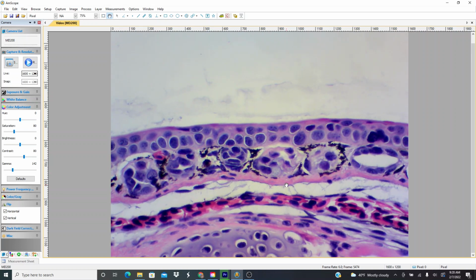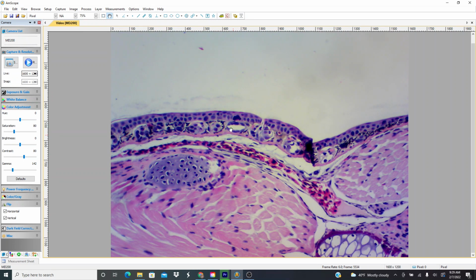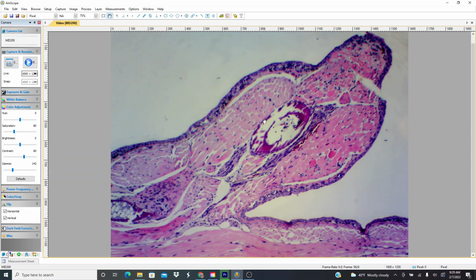Yeah, this is the skin. It doesn't really look like human skin. Made of a single layer, or 2 layers of cells actually. You can see there's a line of nuclei going this way, and then another one at the bottom called the basal layer. But I'm not sure what we're looking at otherwise. This right here, let's see what this is.